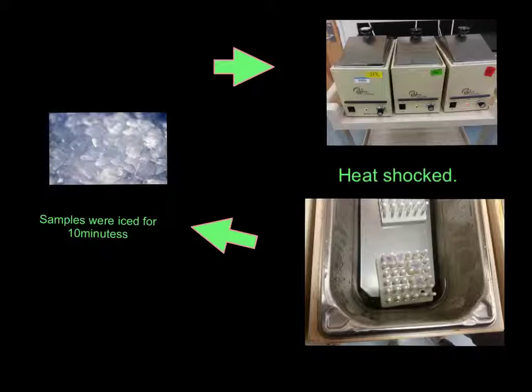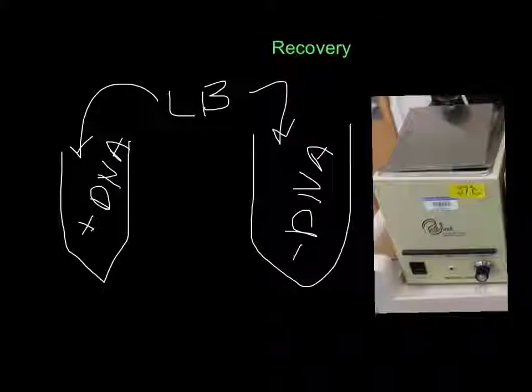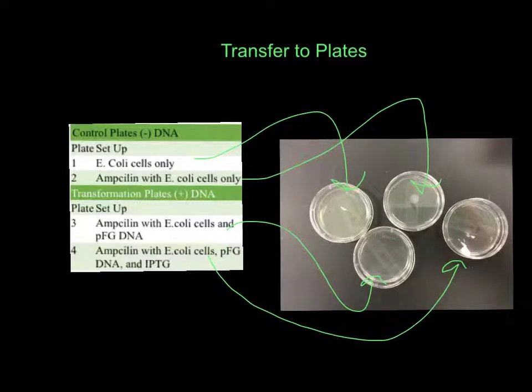After 2 minutes, they were placed in recovery. Recovery allows the DNA to get settled. LB Luria broth was added to each tube. They were placed at 37 degrees Celsius. Luria broth was added because it was important for the cells to recover. We will now discuss the plates that each tube will be placed in. There are 4 different transfer plates. After placing the E. coli cells at their optimal temperature, they are then transferred onto the plates.